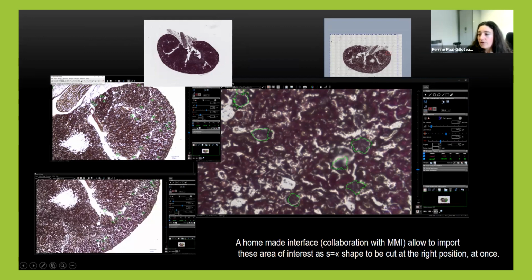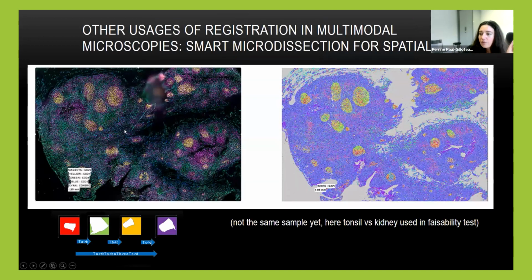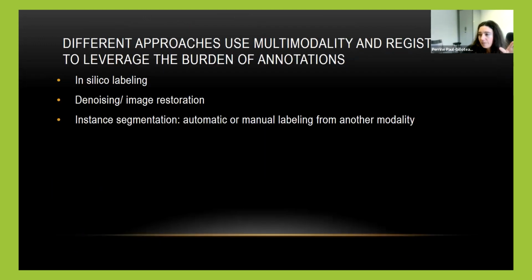And it's on the whole image. I mean, you don't have to acquire the rest of the image. You just get a small image, and they are here for the whole sample. So this part is not done yet. We have identified a few cells, for example, and now we are setting up the workflow to go from the multiplex imaging system to the slide scanner.